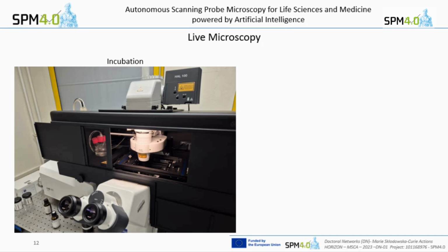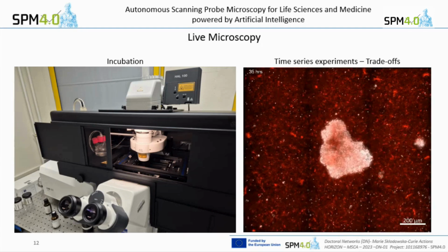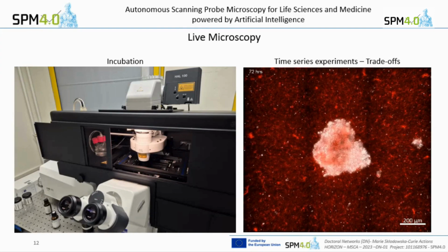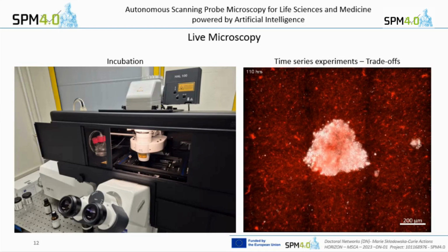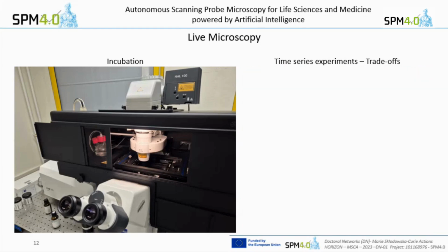This is just an example from Leipzig, a confocal laser scanning microscope, and we have this incubation box here, which can be heated up to 37 degrees. And there you have this CO2 supply for your sample. With that, you can then also do confocal imaging over a long time. This is what you see here. This is a piece of a breast tumor, again on top of a collagen gel, and it interacts, it pulls on the fibers. You might see, now it's pulling more. And this goes over the course of 5 days or so. So this stuff can stay alive. Yes, so live imaging works.